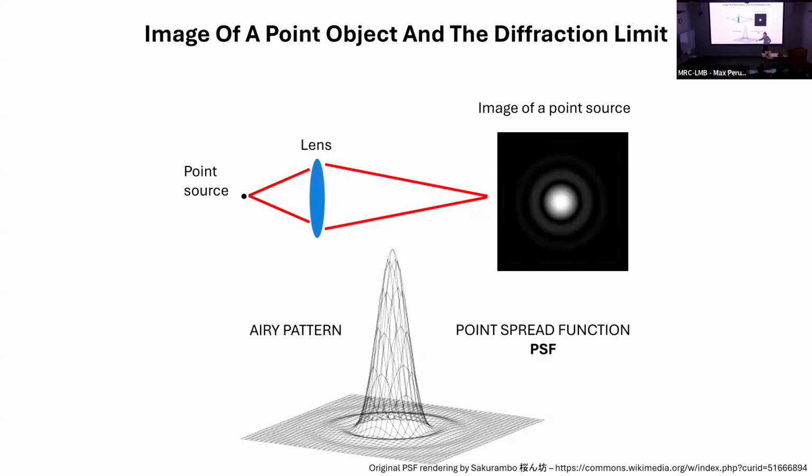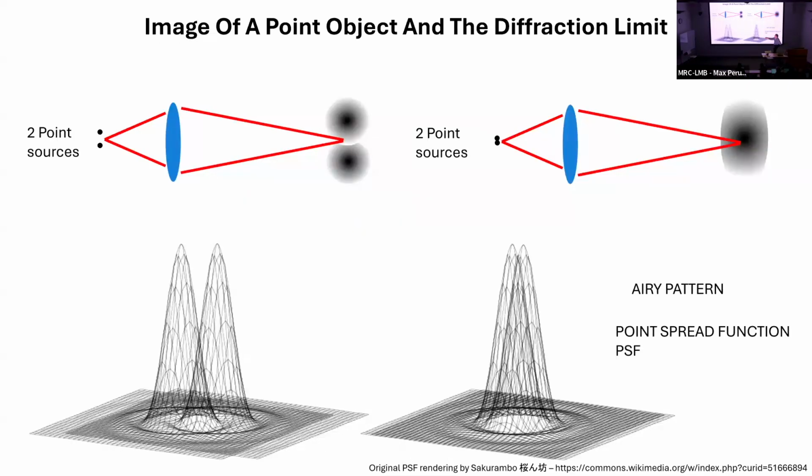that sort of looks like in 3 dimensions. This we call the point spread function. And in this instance, the lens itself is actually forming the far-field diffraction pattern, and that's what's going on in the microscope. And so the resolving power is very, very strongly linked to the size of that function there. So, we've got 2 point sources.